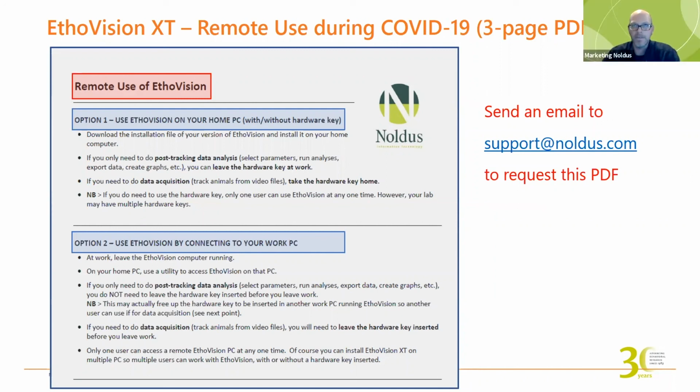That's right. In the acquisition, you can only set one inter-trial interval, but if you set them in the trial control settings, if you have the trial and hardware control module, you can do it. But I think that's within one. Dee-Lyne is absolutely right.